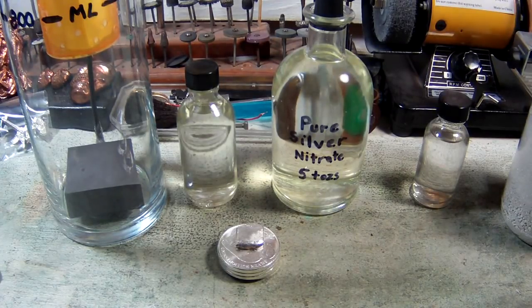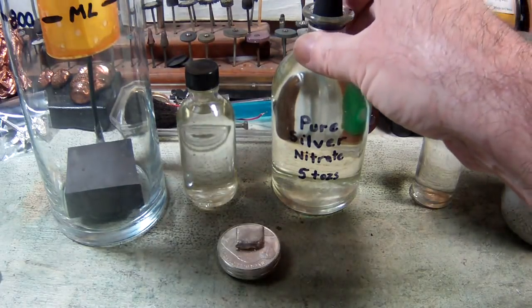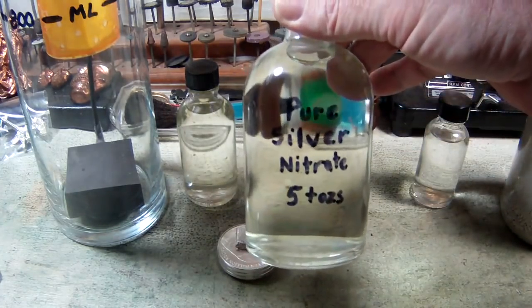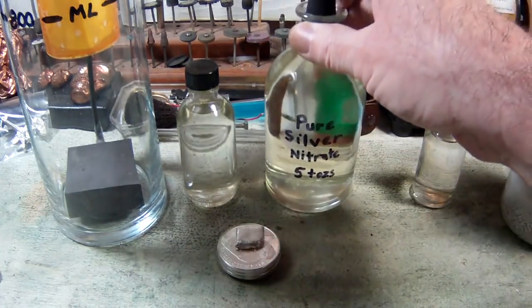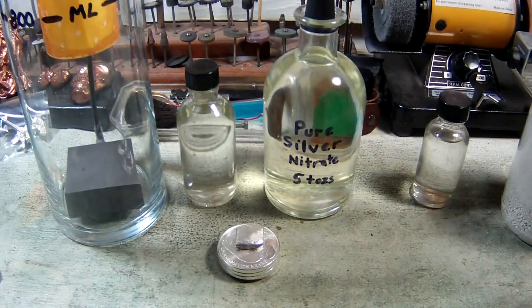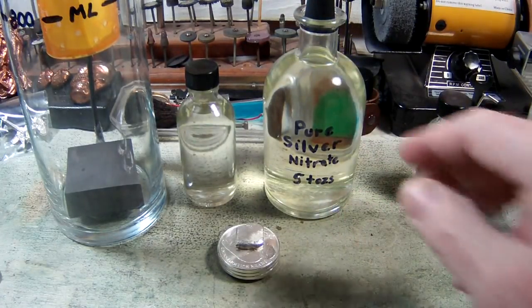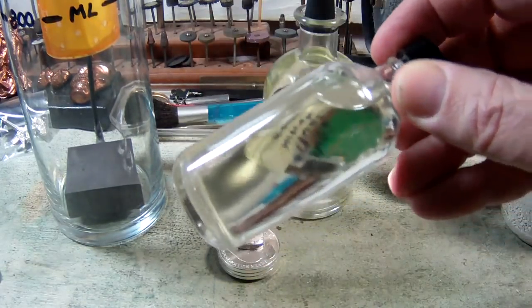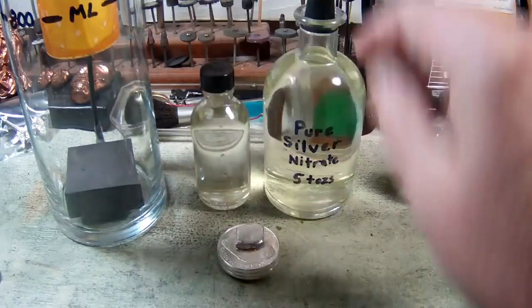The very first thing we're going to need to use this silver cell is some silver — specifically pure silver nitrate. You can see on there that I have pure silver nitrate written on it, and unlike when we're doing a refine, this is absolutely clear. There is no color to this at all, and I'm going to explain why.